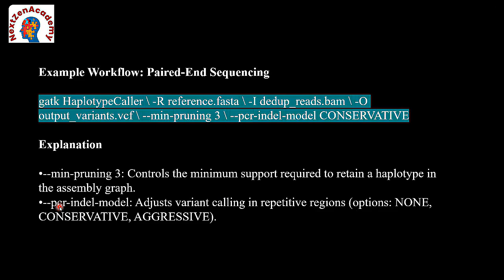That can be given in an interval.bed file, where it has a chromosome and a gene list, which is a predefined panel of known variants.